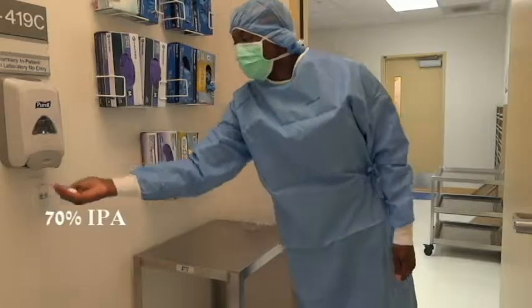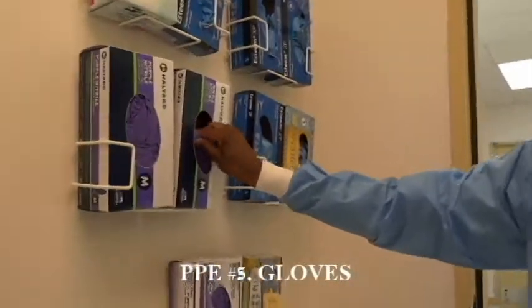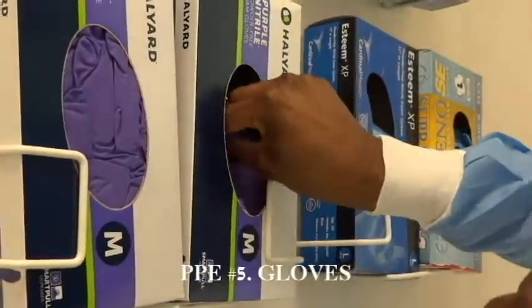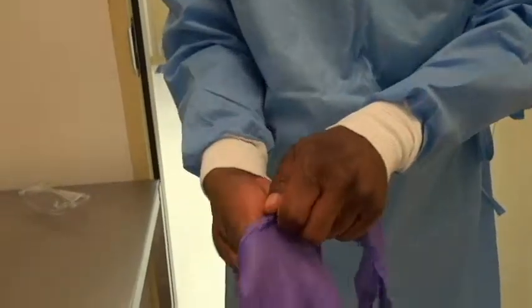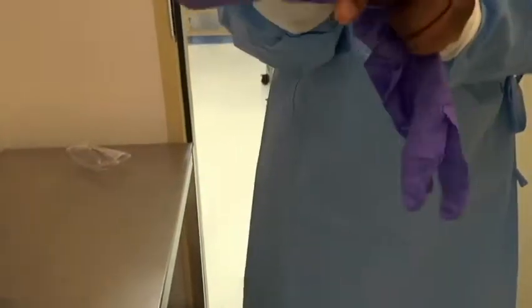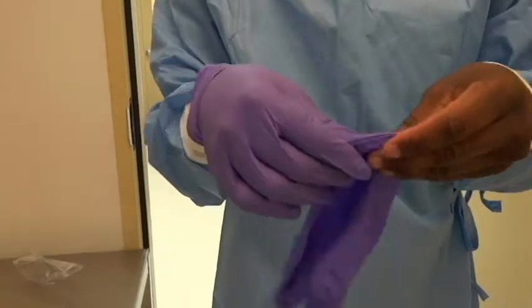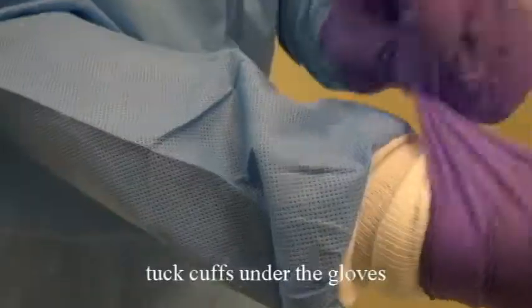Reinforce your hands with 70% IPA. Don gloves. Be sure to pick the size that fits you. Be sure to tuck cuffs under the gloves. Sanitize glove hands with 70% IPA. Don safety eyewear.